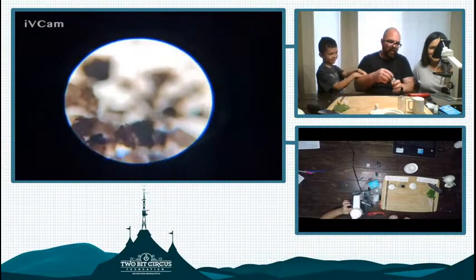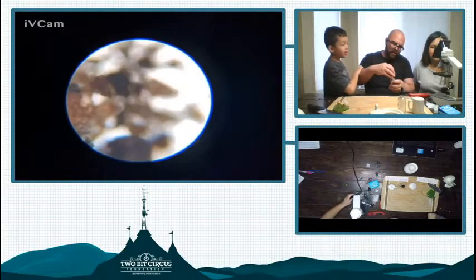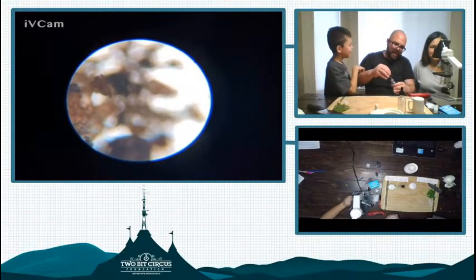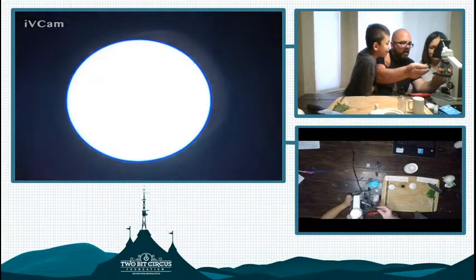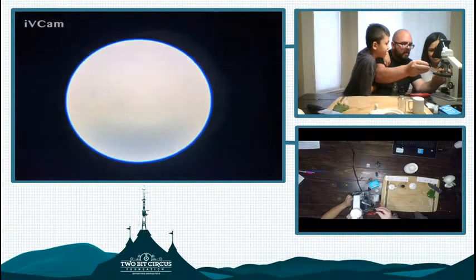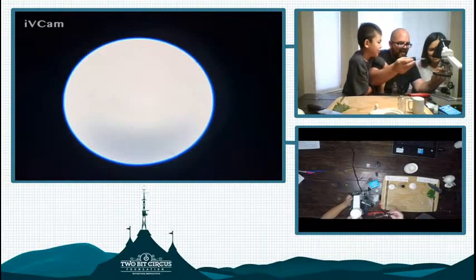We'll add water here to test the water with the dirt. That way we can look at mud. I don't think we're gonna see much under the water alone. I'm gonna just put that aside. That's its last evolution. Mud is dirt's evolution.